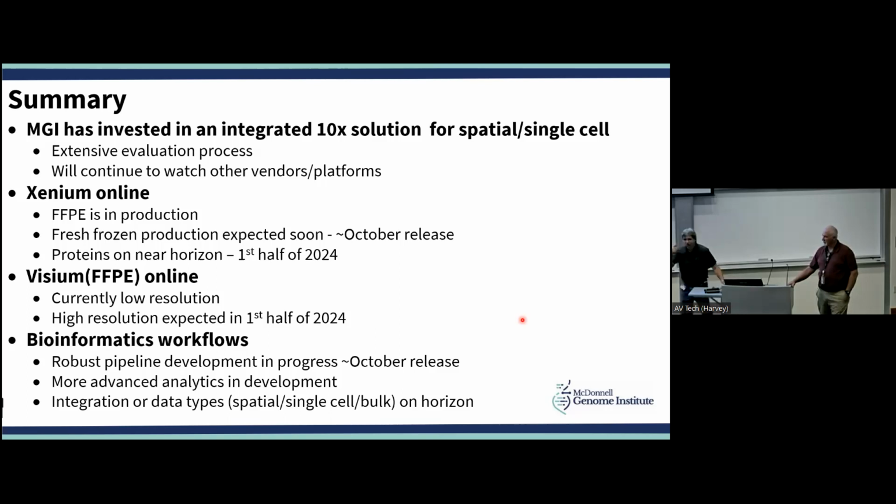Well, a couple things. Basically, the alignment is key, especially making sure that it aligns well with how you've done, like if you're going to do an H&E or something like that for overlay. And there are alignment points on the corners, and you've got to make sure you keep things within that. If anything goes out, it's a problem. If you put multiple sections on there and there's any crossover, it gets a lift, and that creates all kinds of problems. So there's really a number of different factors depending on what you're trying to do with the slide.